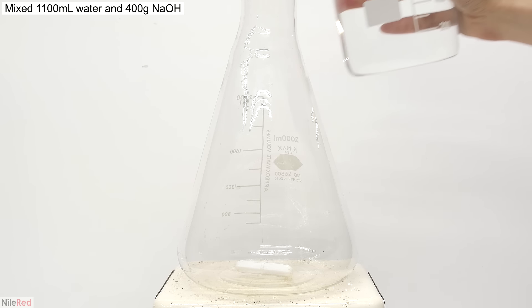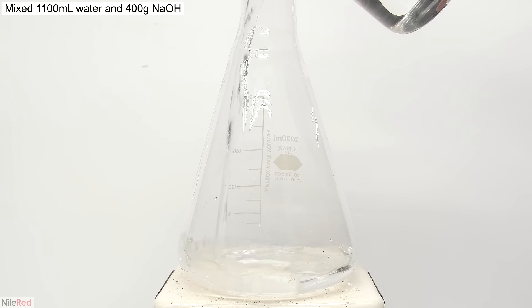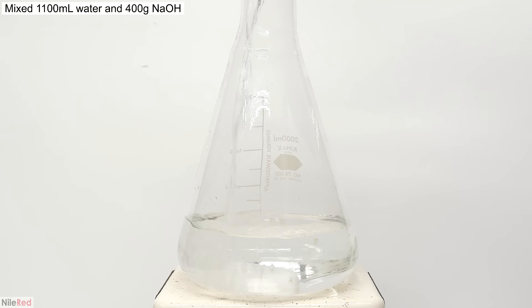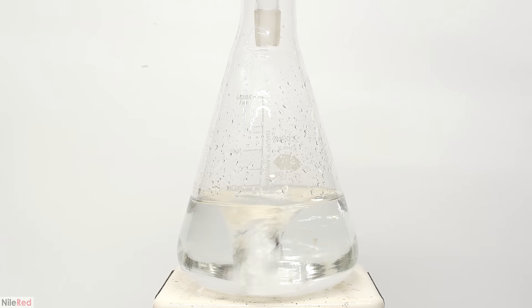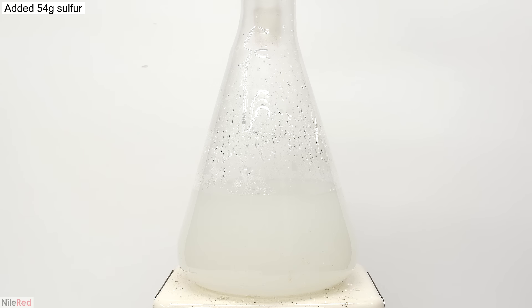Now what I need to do is make a polysulfide solution. The first step is to make a strong sodium hydroxide solution by mixing 400 grams of sodium hydroxide in 1100 milliliters of distilled water. I turn on very strong stirring and then dump in all of the sodium hydroxide. One thing to keep in mind is that dissolving sodium hydroxide in water is very exothermic, so it's going to heat up a lot.